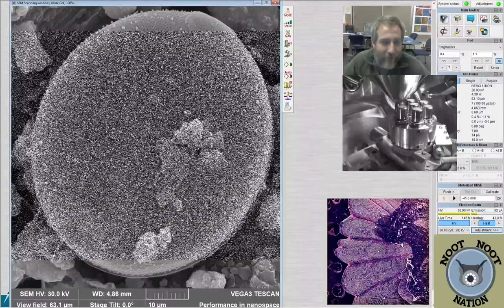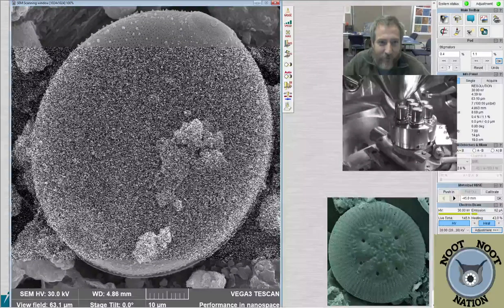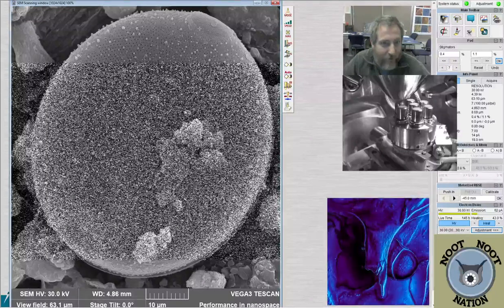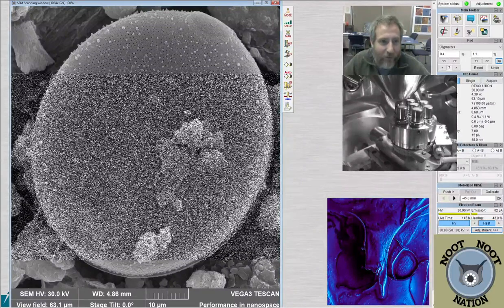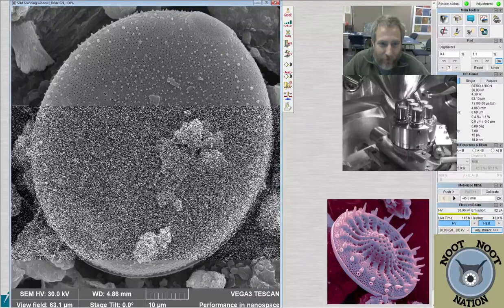Okay, so you should be able to see these little tiny pore fields up here and how distinctly different they are. We usually refer to these as ocelli or pseudo-ocelli, depending on whether or not there's a hyaline area around them. I believe these are actually ocelli because there's a hyaline area around them. And then you can see the structure that we were looking at in here, which has the pores and then these little spines or granule structures that are pointed up from the surface. So this is a pretty cool picture. I think it's going to look gorgeous on that poster.